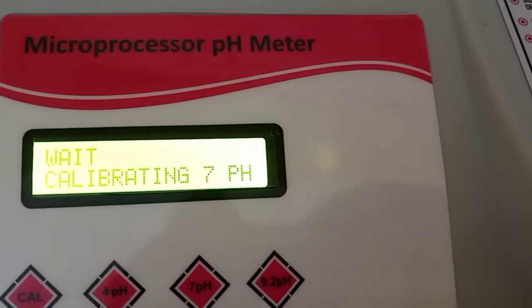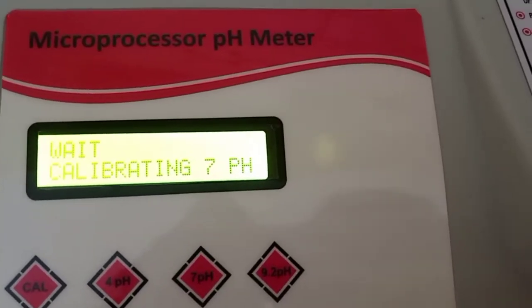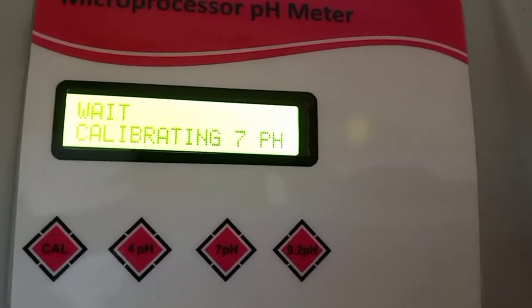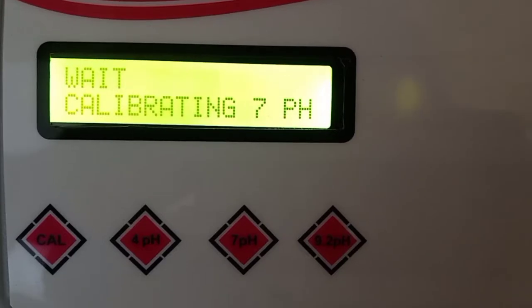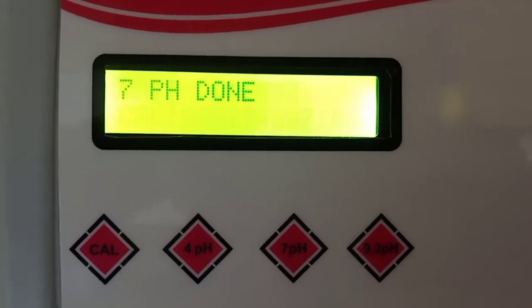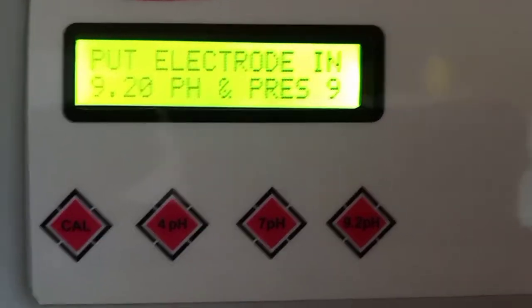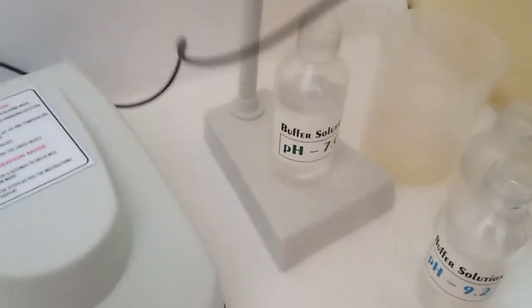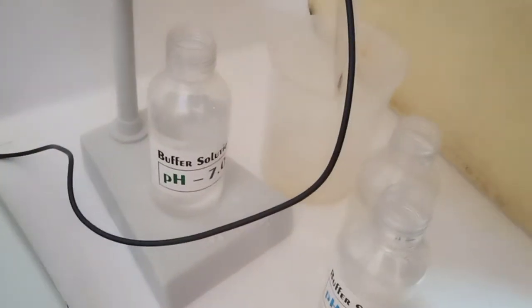Press the 7 button and wait approximately 50 to 60 seconds — the time may increase up to 2 minutes depending on the standard solution. Just wait for the calibration to complete.